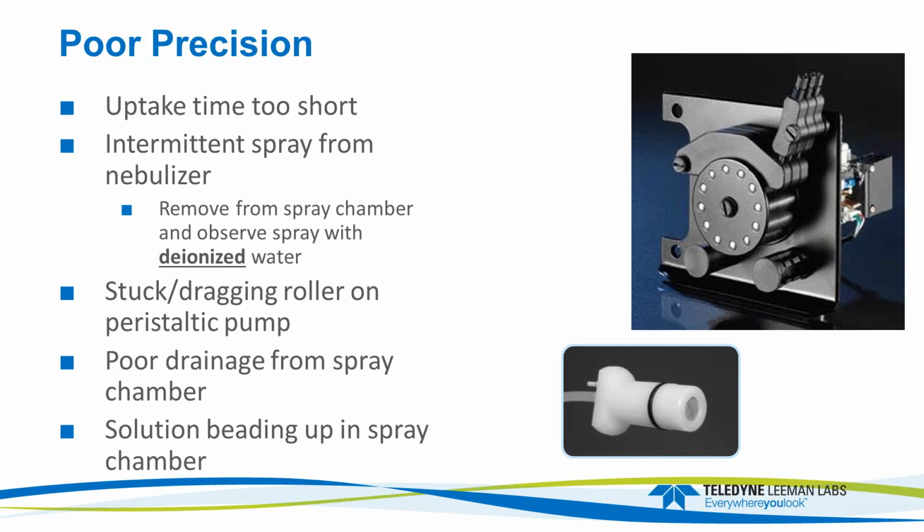The way these systems work, they do a quick pre-shot to know what's in there, and if it doesn't see anything, then it doesn't have to really worry about that element too much, or at least it doesn't think it does. And then the next thing you know, halfway through the integration time, the sample hits, and you get much higher intensities than you'd expect. So make sure your uptake time is set right.